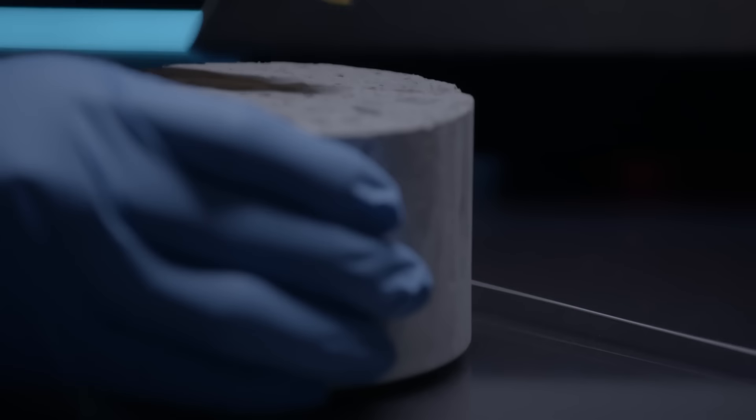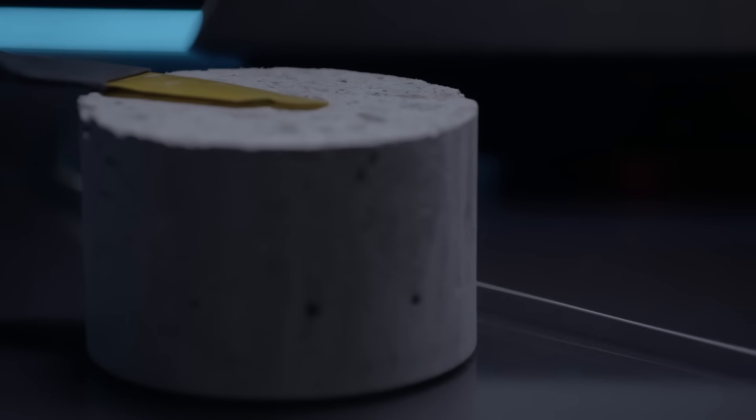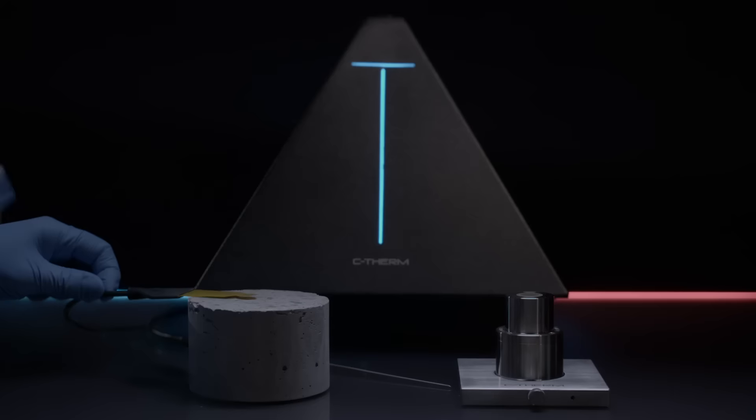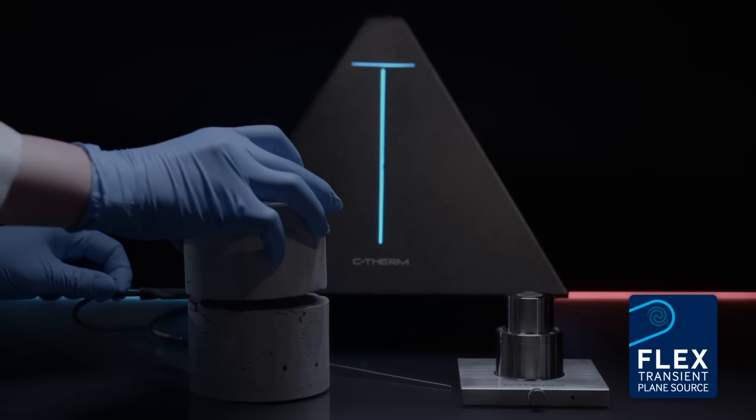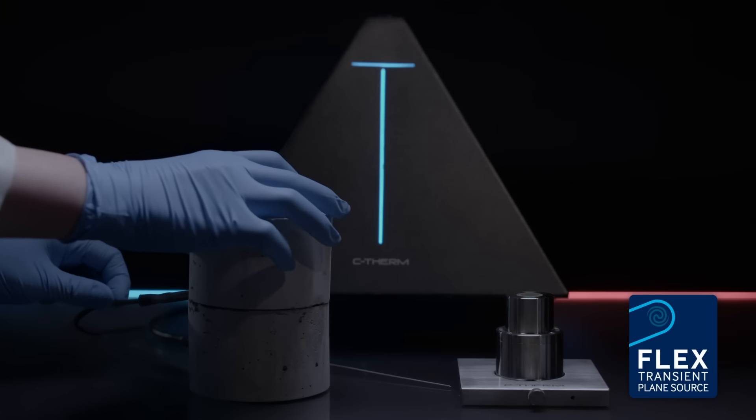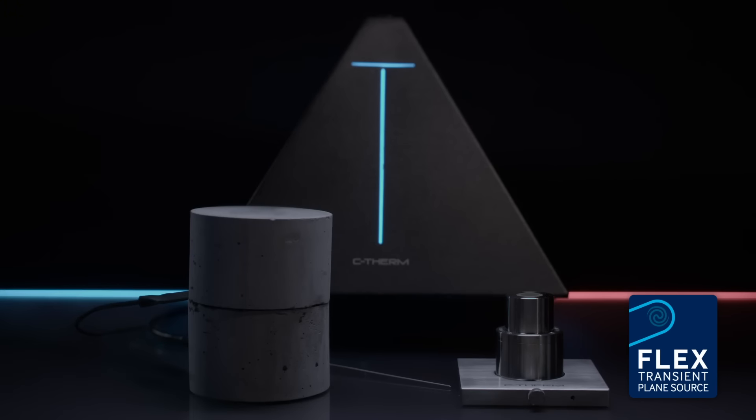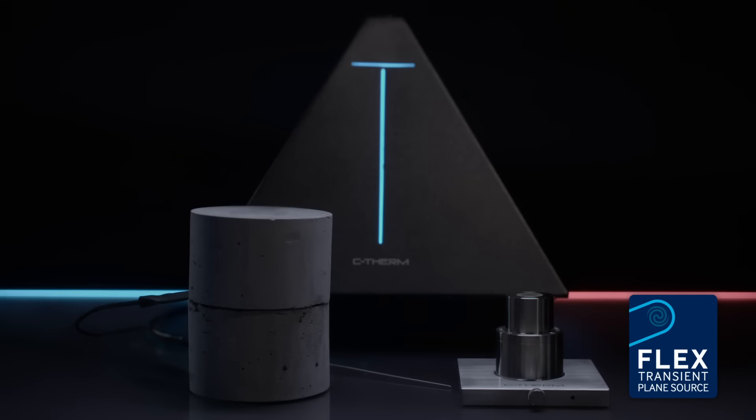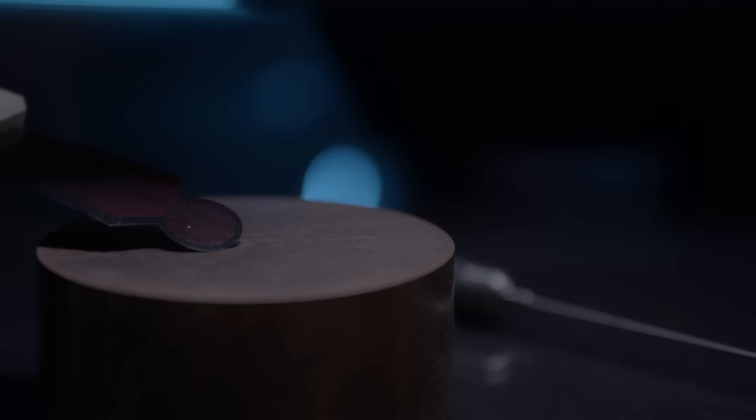With a double-sided sensor available in different sizes, the Flex TPS, Transient Plane Source method, provides researchers the greatest flexibility over experimental parameters, including timing and power.